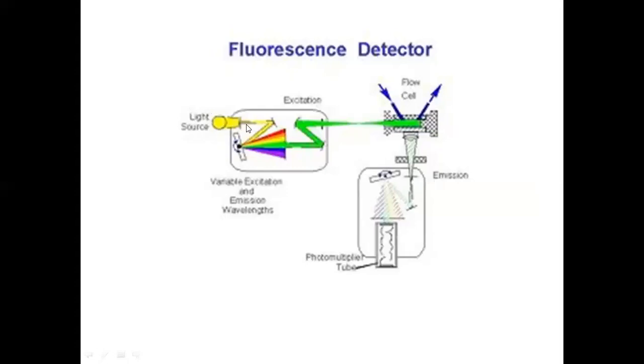You will choose a beam of light radiation of a particular wavelength. After the absorption of that particular light radiation, the molecule which is present in the flow cell will show excitation to the higher energy level. Okay, a light source is glowing, will be illuminating, and a required beam of radiation will be selected by means of a monochromator. This is called the excitation monochromator. So this excitation beam is required to make the molecule excite into the higher energy level.